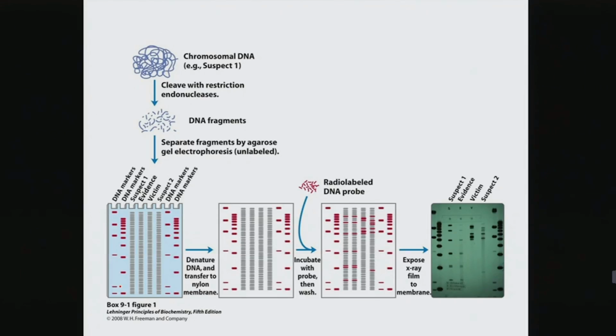And then you can get this blot right here through X-ray exposure to a film, and just by looking at the film, whose blood was it as part of the evidence at the crime scene? Was it the victim's, suspect 1, or suspect number 2?